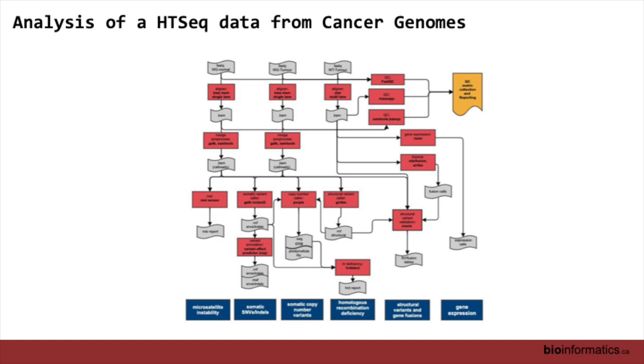What I'm showing here is a complicated pipeline that we run as part of the genomics program. And it actually leads into our clinical reporting pipeline, which Ian is going to talk about later tomorrow. There's a lot going on here. It's a whole genome transcriptome pipeline. That means we sequence a tumor with whole genome sequence libraries, and we do a matched normal. At the same time, we also prepare for RNA-seq whole transcriptome data.